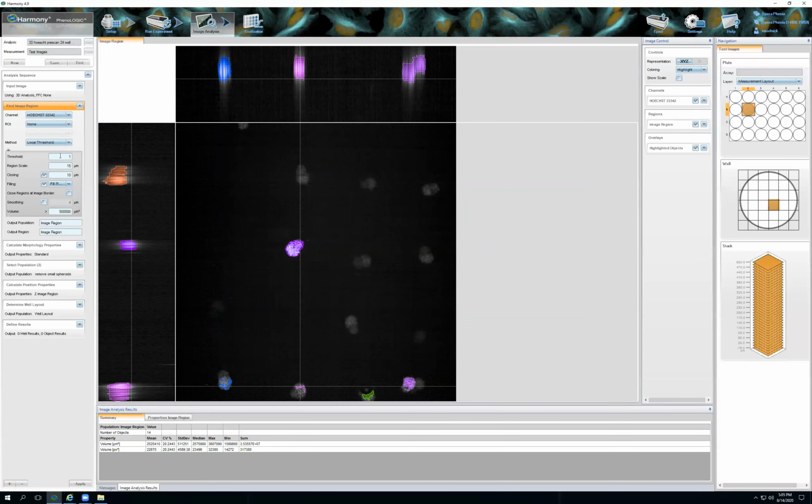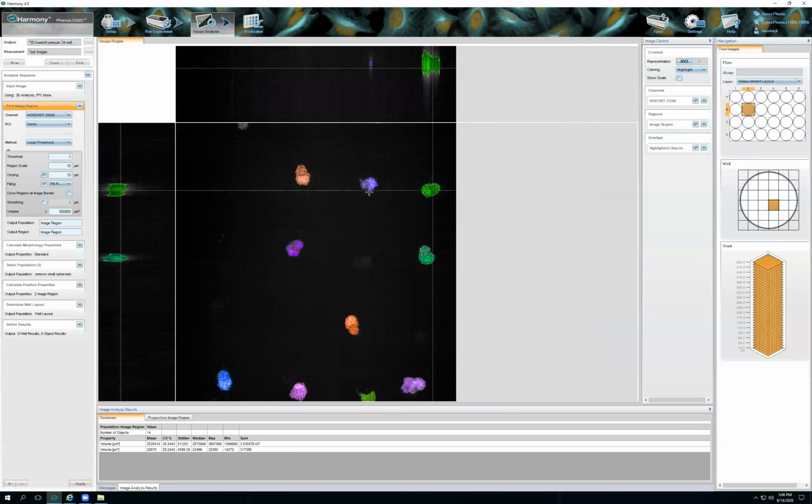So you can see, like here, I have it at 1, but if you change the threshold to 5, then the cutoff is too high and you're not really finding anything. So you can kind of play with this. Like I bet if I do like 3, that will change it. It'll identify a smaller area or nothing. So I'm going to keep that at 1. Ideally, the less settings you have to play with, the better.